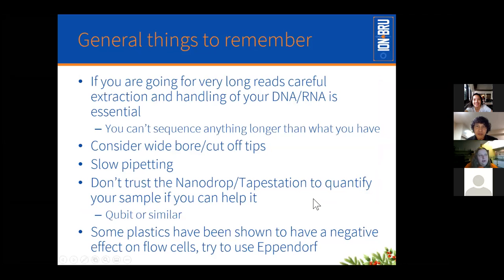So general things to remember with nanopore sequencing in general, this isn't really specific to this protocol. If you are going for very long reads, which the sequencer can do, you need to be very careful extracting and handling your DNA, or your RNA in fact. You can't sequence anything longer than what you have. So if during the extraction process you break any strands, obviously you're not going to get any reads that are longer than the strands you have.